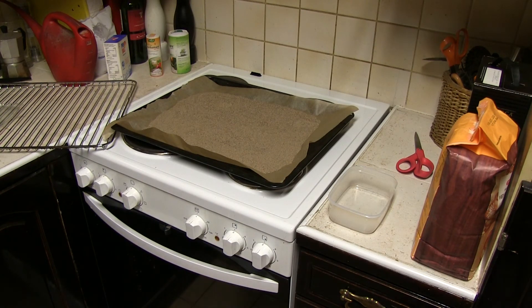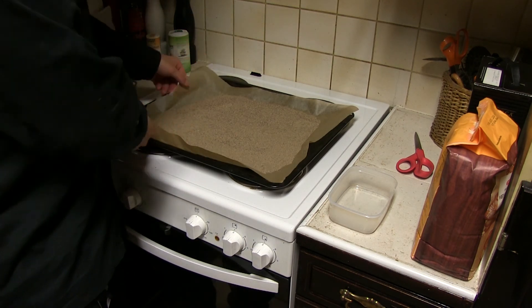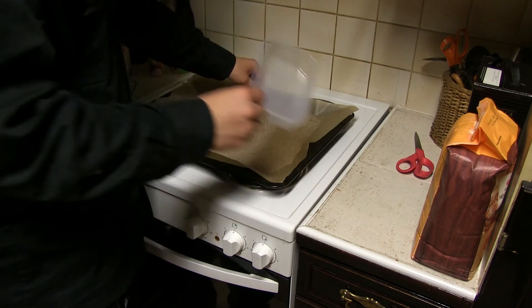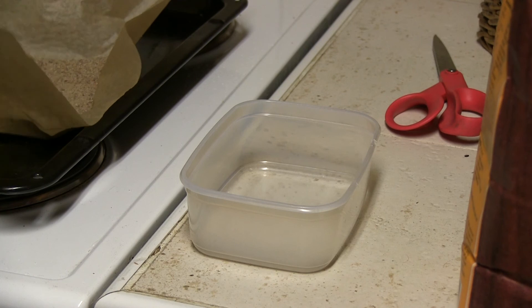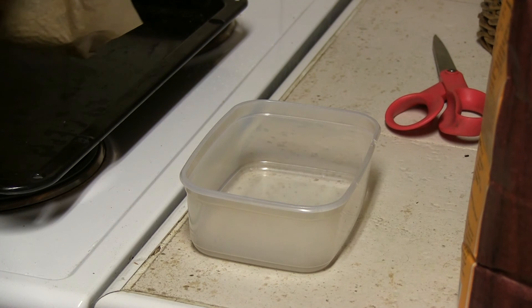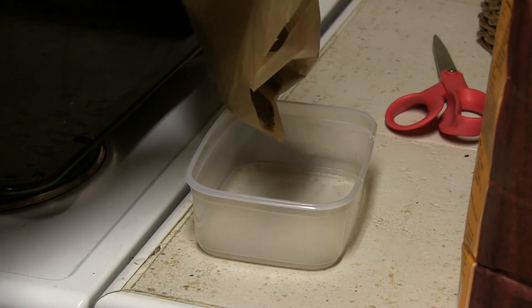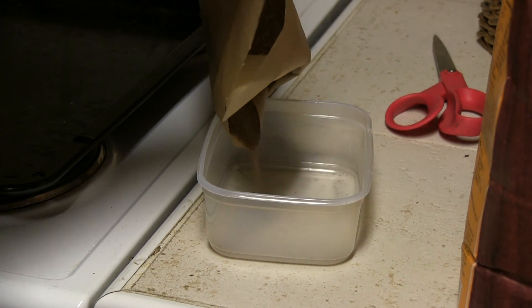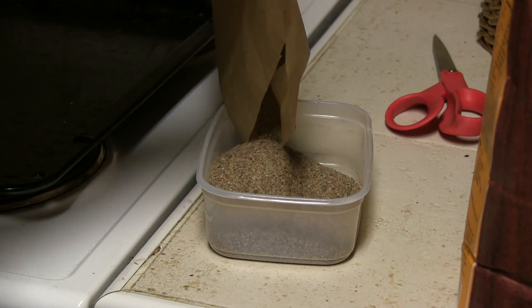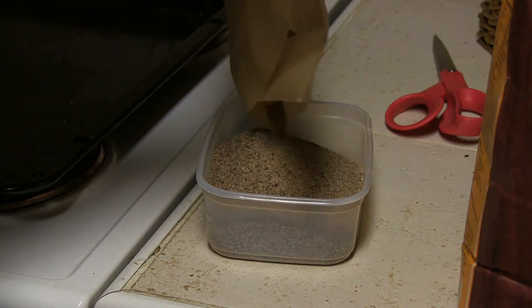Now I have this slightly warm but dry sand, and I'm going to put it into this container.